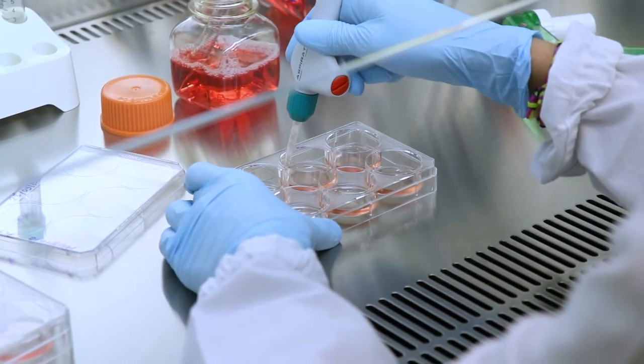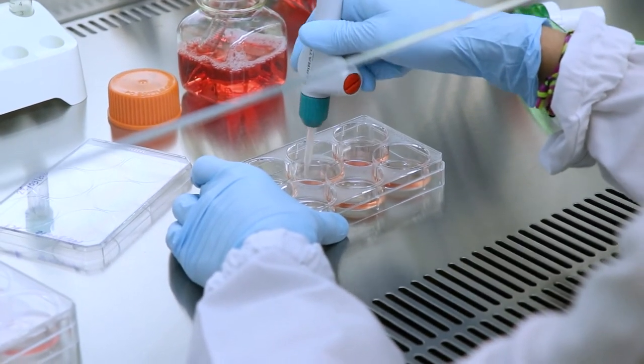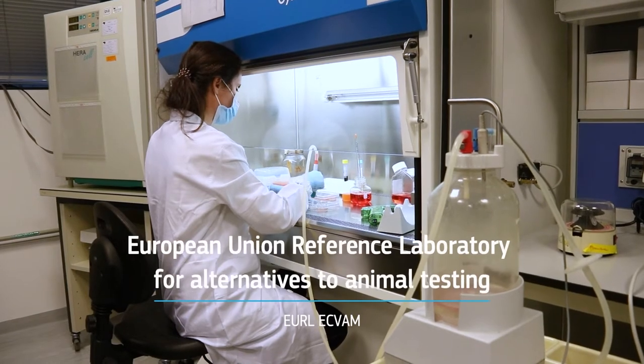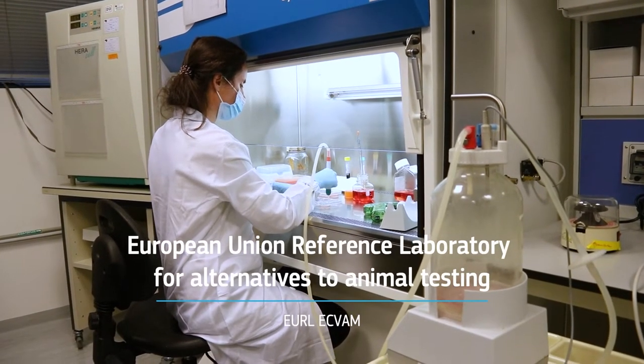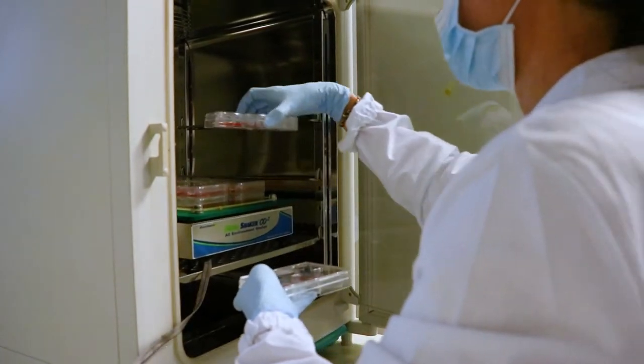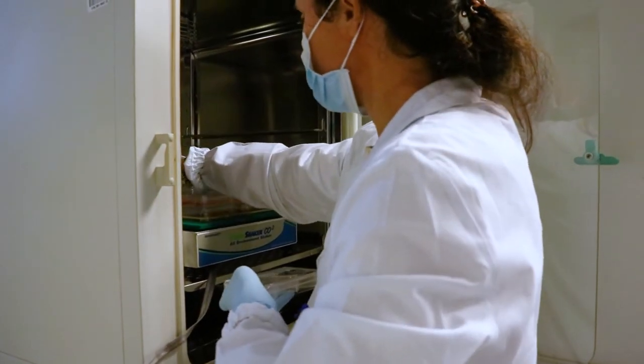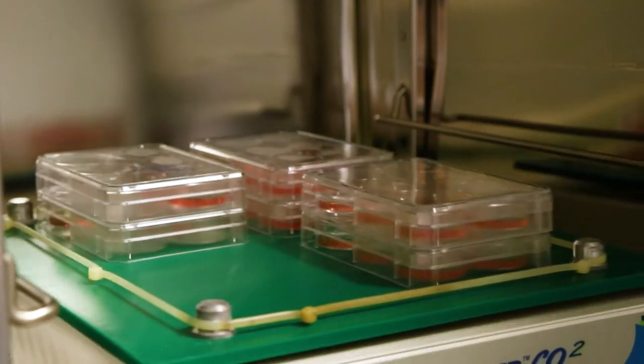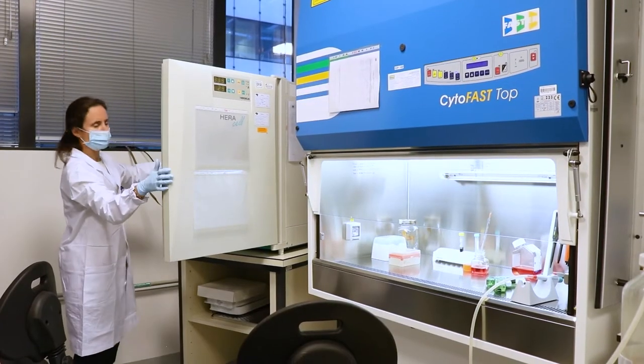We launched an organ-on-chip laboratory in the JRC's European Reference Laboratory for Alternatives to Animal Testing, also known as EURL-ECVAM, to start investigating the use of these technologies for chemical safety purposes and to help our scientists acquire hands-on experience.